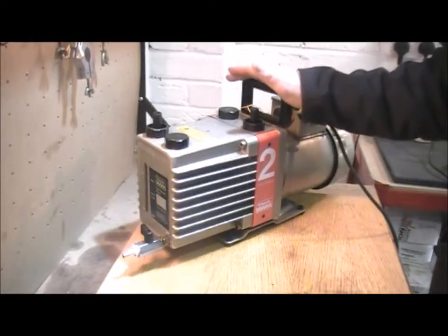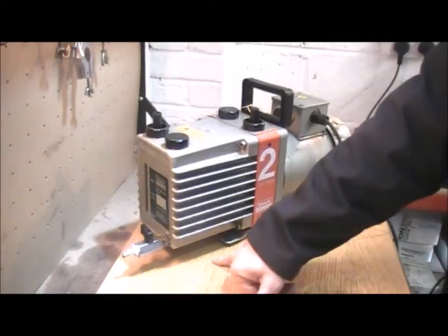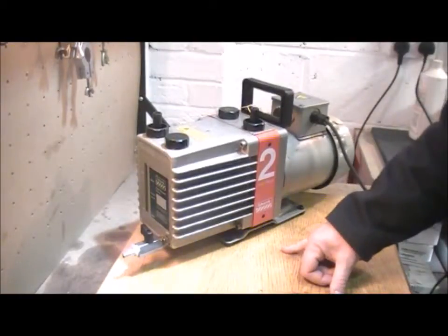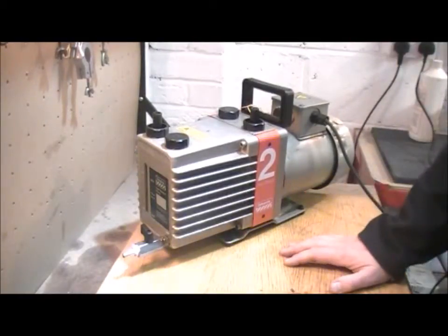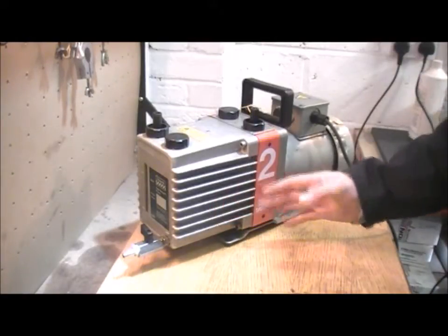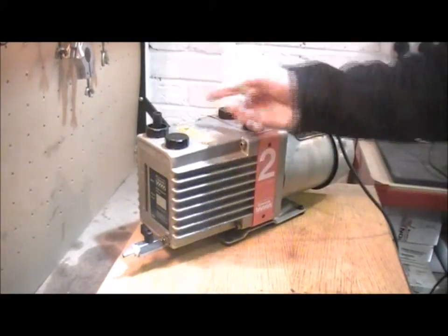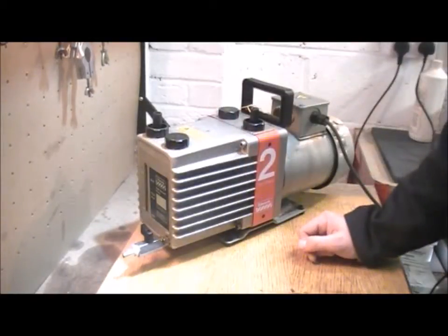But the common ones that you might see — oil normally collects underneath the pump. There are two areas it can come from. If the pump has been recently serviced, there will be a gasket here that seals the oil box onto the pump. It could be that that's not quite in the right position and it might need to be adjusted, or you might just need to tighten down the bolts that hold the oil box on.